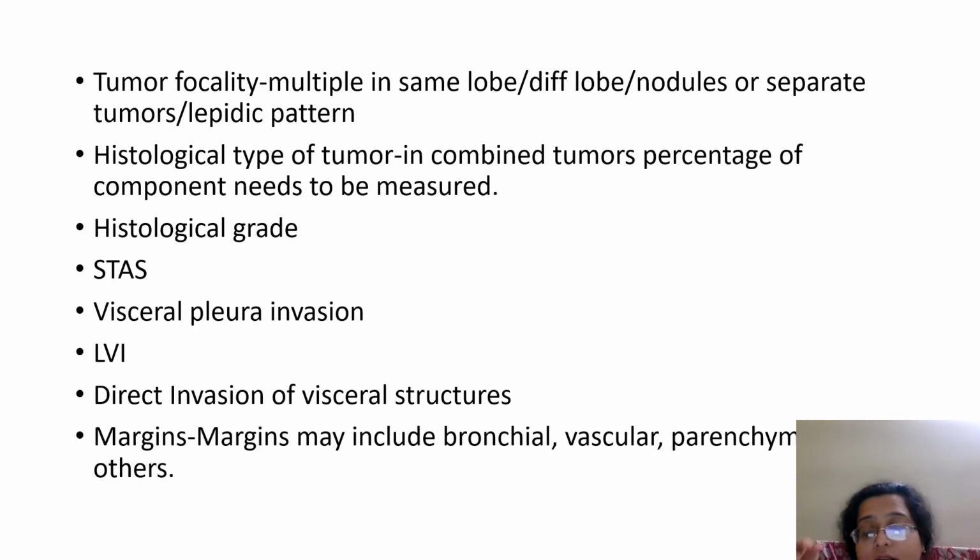Then if there's a tumor, is it multiple or single, only in one lobe or in multiple lobes, one segment or together? And if you are cutting open the tumor after fixing it, do you see a uniform thickening around the air spaces, the areas which you open, or is it a well-marked circular tumor? Is there a cavity in the tumor? All these give a direction towards whether it could be SCC or a different pattern tumor. SCC is a cavitary mass. A lot of necrosis occurs in SCC. Then small cell tumors are mostly in the bronchus area, 2 centimeter, coin-shaped.